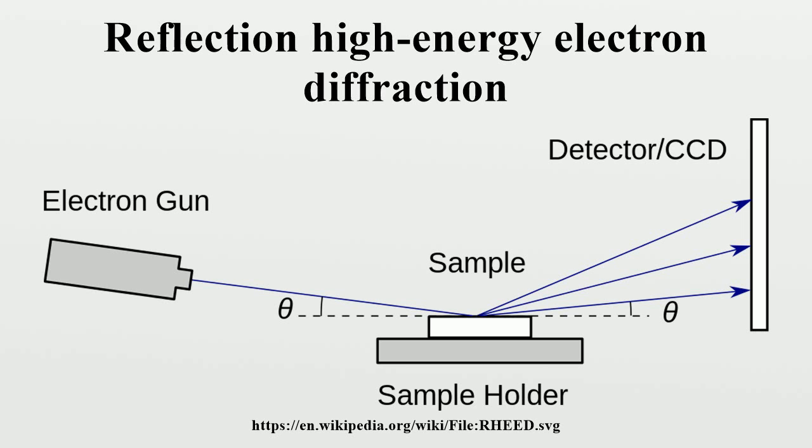Each successive intersection of a rod and the sphere further from the sample surface is labeled as a higher order reflection. The center of the Ewald sphere is positioned such that the specular beam forms the same angle with the substrate as the incident electron beam. The specular point has the greatest intensity on a RHEED pattern and is labeled as the (00) point by convention. The other points on the RHEED pattern are indexed according to the reflection order they project.